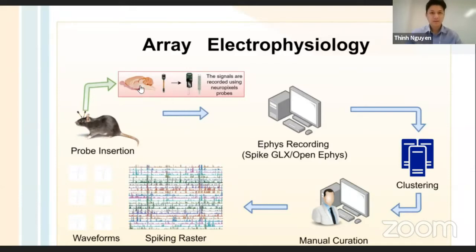So in this experiment, you would perform some sort of surgery to place these Neuropixels probes inside one or several regions of the brain of interest. Maybe you place 2 or 3 or 4. I know that some labs are doing 5 probes at a time. Then from each probe you acquire ephys recordings, as the animals are doing some sort of behavioral task, you start acquiring electrical activity from the brain.